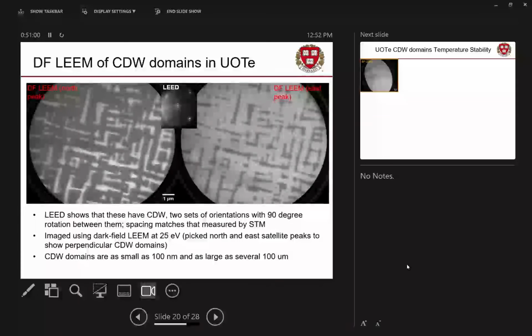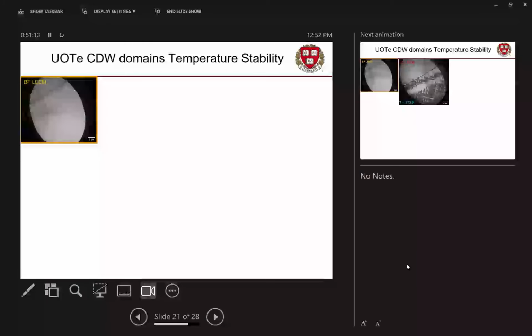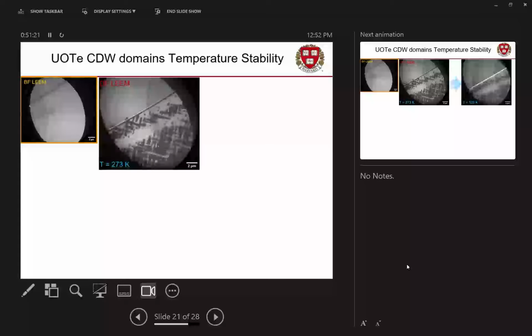We can image them on the micron scale. We can see that sometimes there's very tiny ones, kind of 100 nanometer. Sometimes there's ones that are several microns long, and sometimes there's whole areas that are just one orientation. Now we can go around mapping them. So then the question was raised, okay, this is at room temperature we're doing this. Do they survive getting hot? Like, when do these stop happening? Do they survive getting cold?